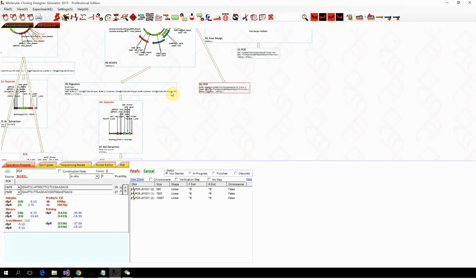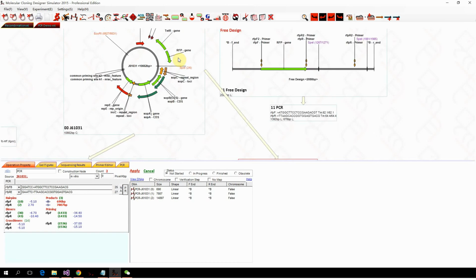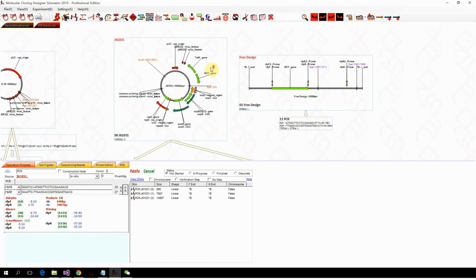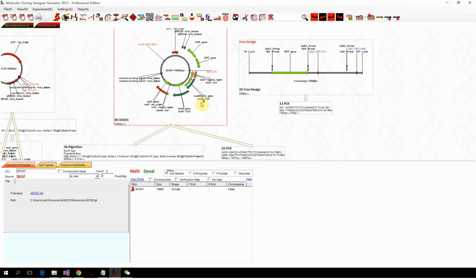And to avoid a pair of primer to produce multiple fragments, especially when we want to do design for given assembly, we only want one product. So we probably can digest this plasmid and just get one fragment of it.